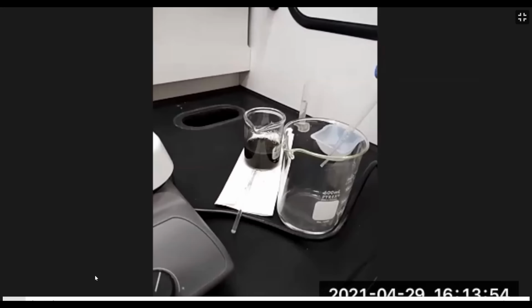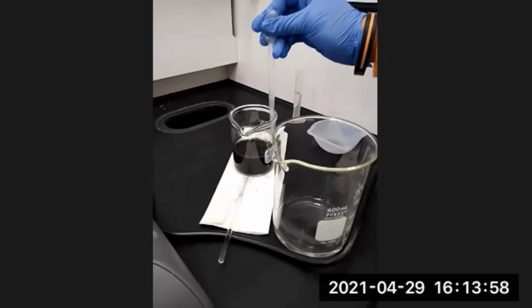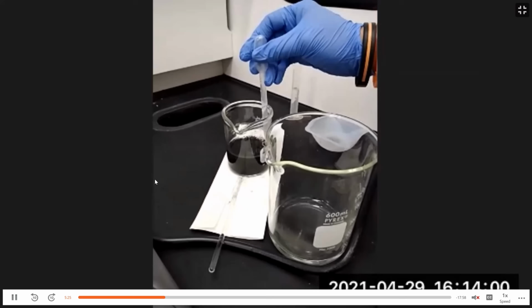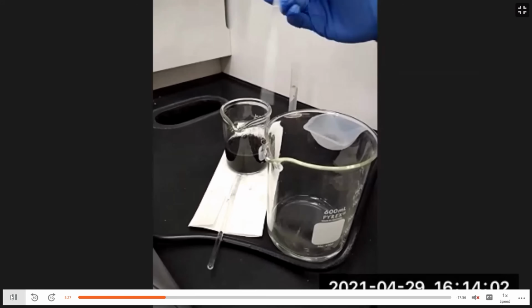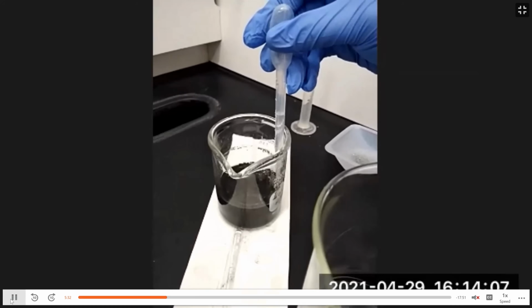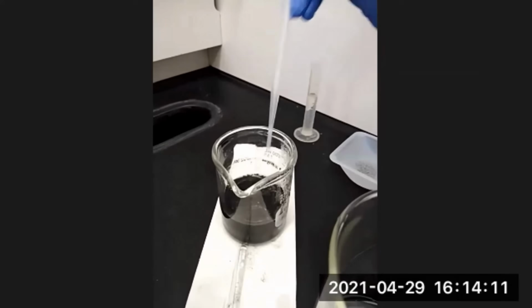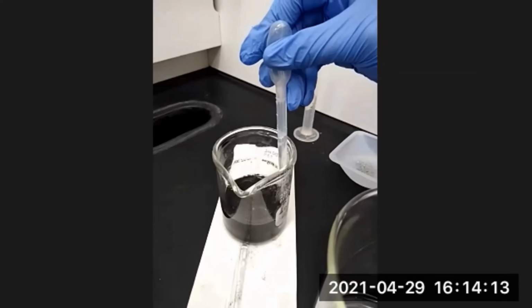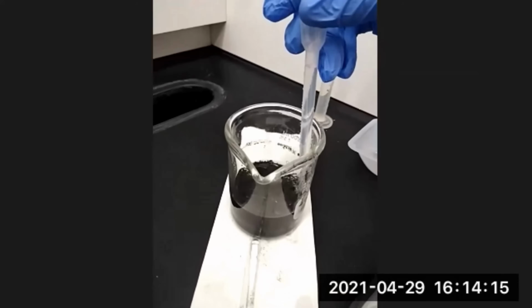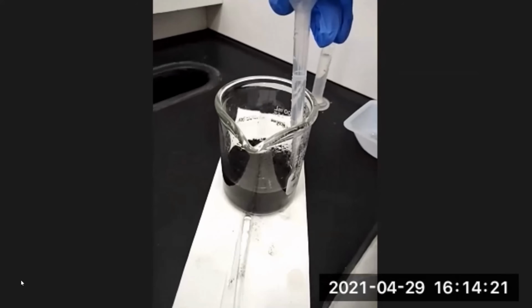And once you get near the precipitate, you want to use a dropper and remove as much of the solution as you can without picking up any of the product. So here this TA is using a dropper to get as close to the product, or to remove as much of the solution as they can without extracting any of the precipitate from the solution.